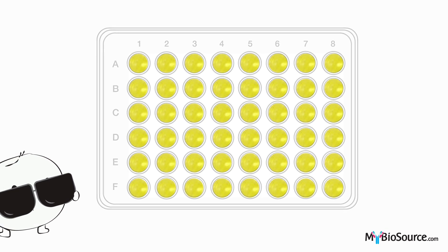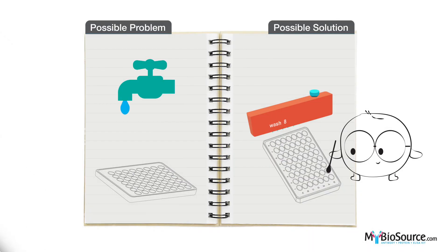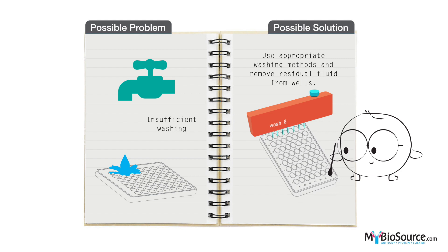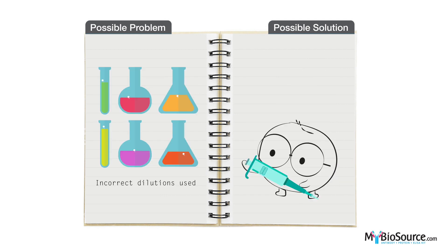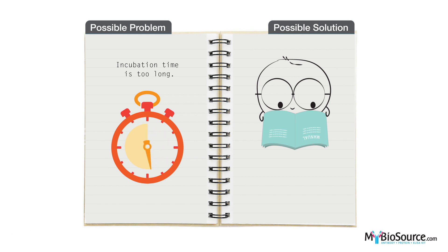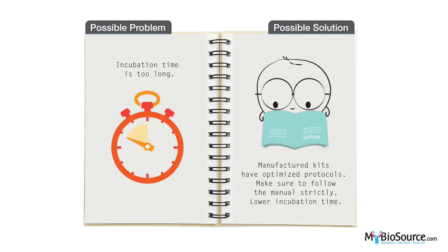Problems with too much signal can be caused by the following: insufficient washing of the ELISA plate. In this case please use appropriate washing methods and remove residual fluid from the wells. Incorrect dilutions may also lead to high signal; please ensure your pipetter is properly calibrated and increase the dilution factor when retesting. The incubation time may also be too long. Our kits have optimized protocols specific for each catalog; please ensure to strictly follow the manual included with your kit and lower incubation time if necessary.